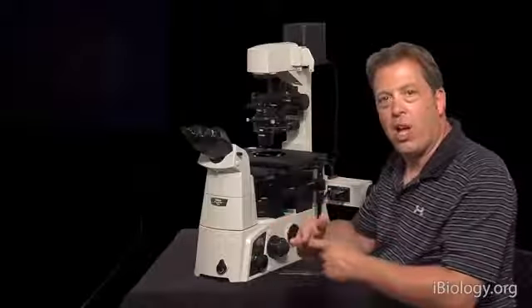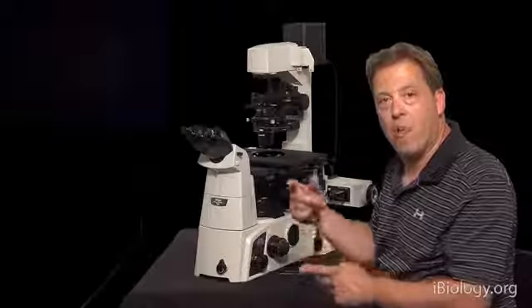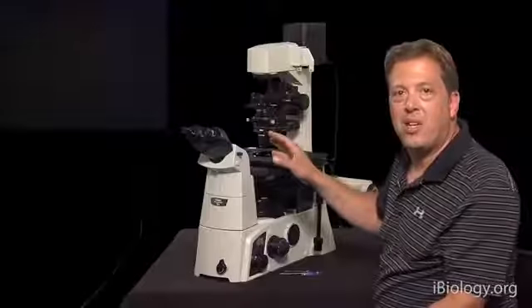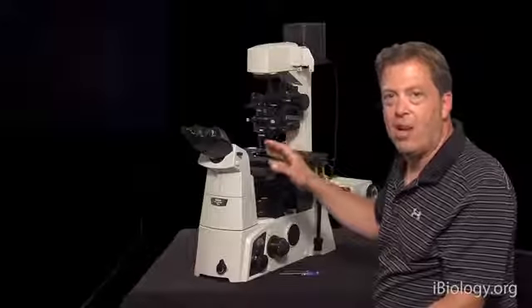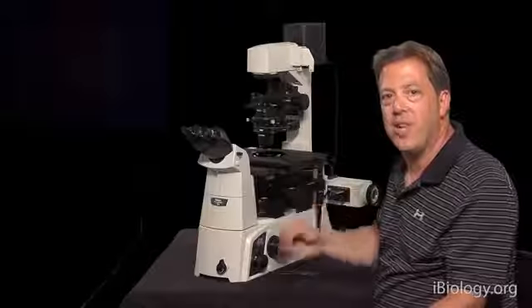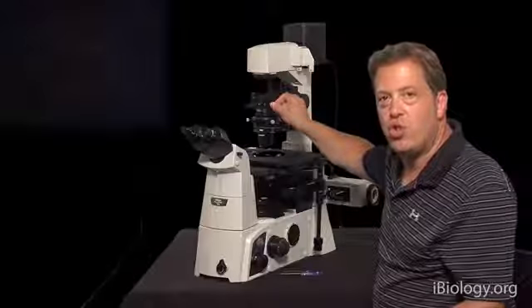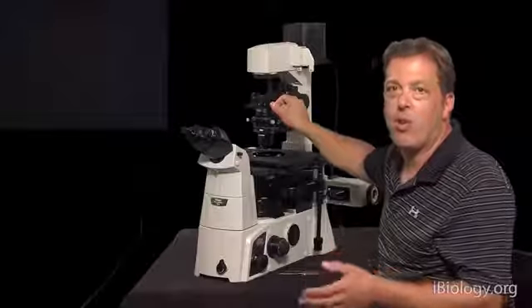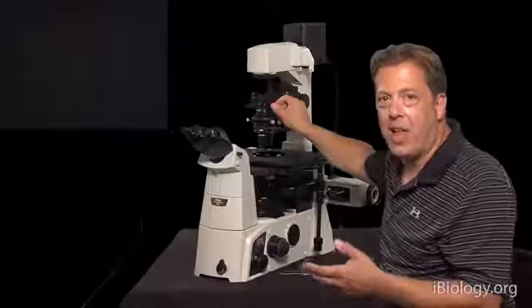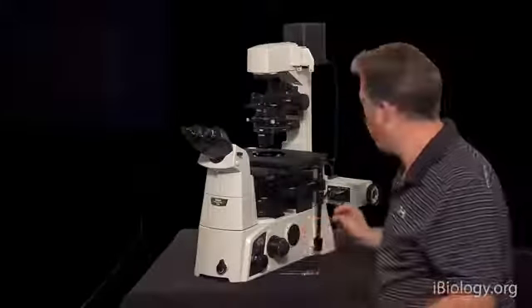And the way you're going to adjust this in the lab, in older DIC systems, some people would like to look at what they call the Maltese cross at the back aperture of the microscope. But nowadays, many new DIC systems don't allow you to do that due to the construction of the system. And the eye is very sensitive to light and dark. So the best thing to do is to adjust your polarizer crossed with your analyzer such that you get the darkest background. That's how you know you're at extinction. And that's what we've achieved here. We have a very black background.